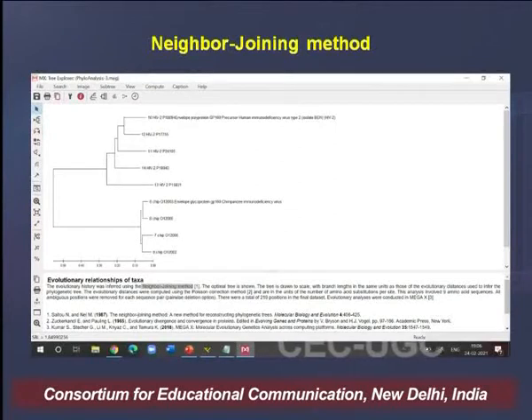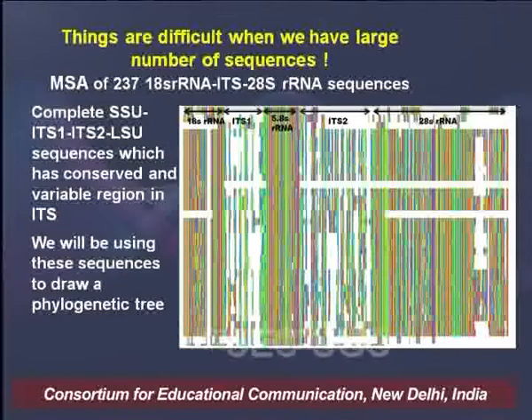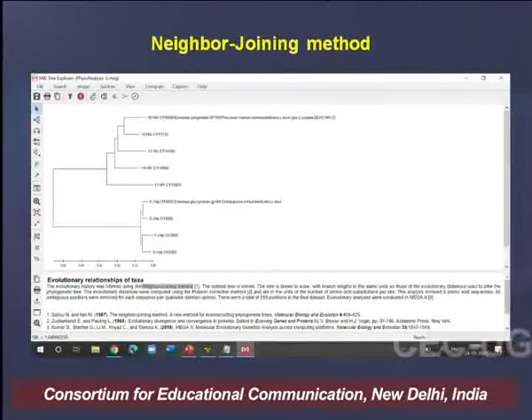But it was very easy. The point to be focused here is that it was so easy, and you see the evolutionary distance written, the similarity in the key at the bottom of this diagram, and you could very easily make it for the sequences, and there were differences. And did you observe the tree made by Clustal? Also we couldn't get it in 2 clades, but here we could get it. But because these were very small sequences, meaning on only 10 sequences we were running, we could do it like a fun. There were no problems arising.